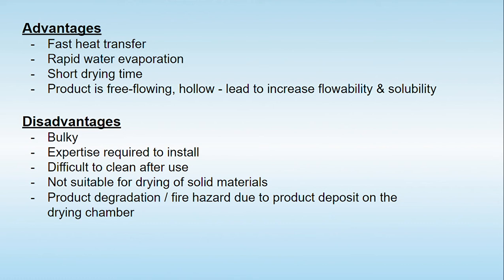The most important thing is that the spray dried product has two unique characteristics. The first one is that it is free flowing, meaning spherical in shape, because each individual droplet is dried. Another thing is that whenever the hot air comes into contact with the droplet, because of the heat transfer it tries to generate pockets, or smaller holes or voids, inside the spherical particles.